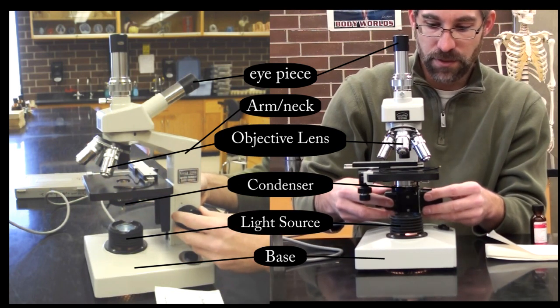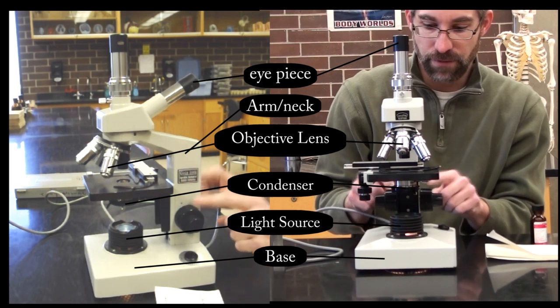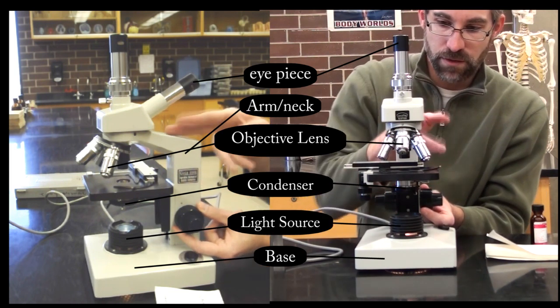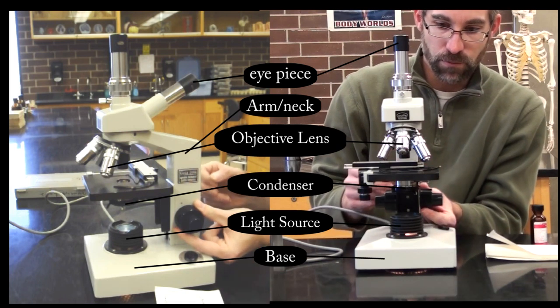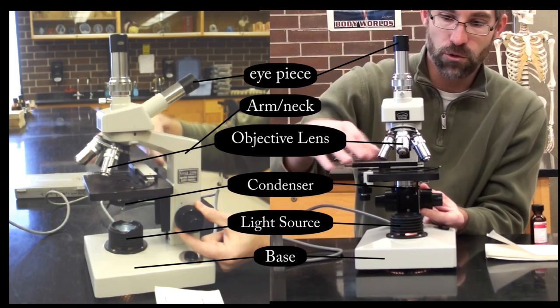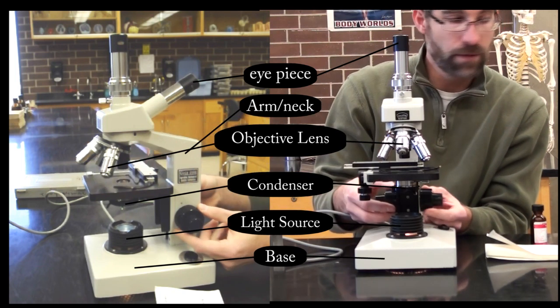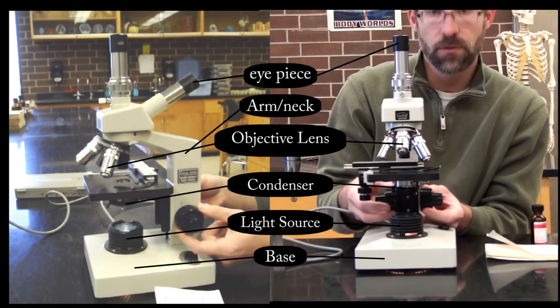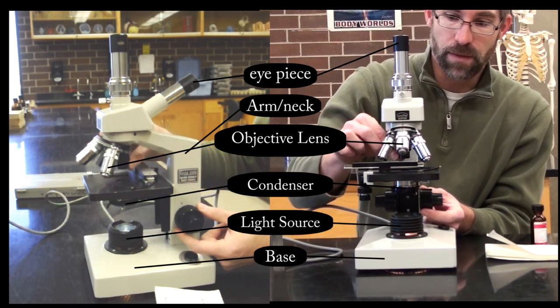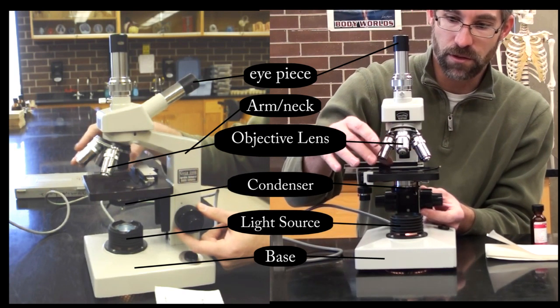These are our focus knobs. We have two of them. We'll have a large one, the closest one to the neck here. This will move the stage up and down in a very coarse manner. So rough focusing we do with this coarse adjustment knob. We will only use it under low magnification so we don't crush our slide or lens.